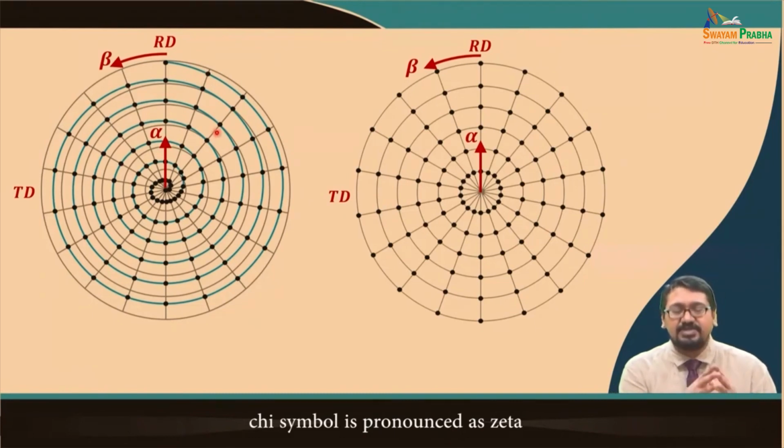And of course, the measurement cannot be done up to 90 degrees, because after alpha equal to 70 degrees the incident beam becomes almost parallel to the sample surface, and so the intensity of the diffraction cannot be obtained. This is known as the defocusing error.